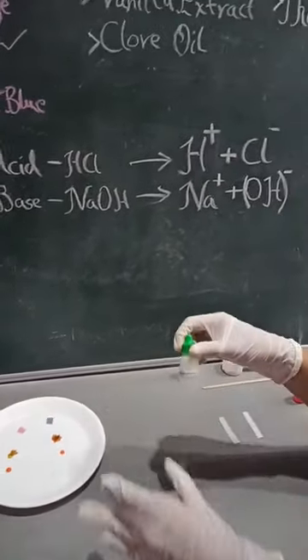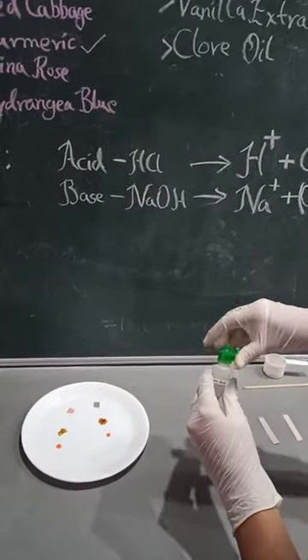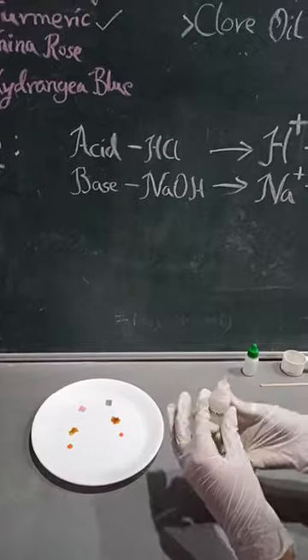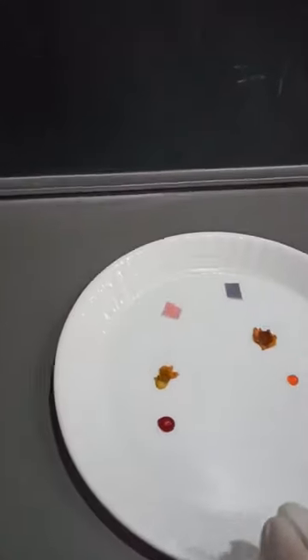Now let's see what color it changes to in contact with the acid. Oh my god, look, it turns a very deep red. Looks so beautiful.